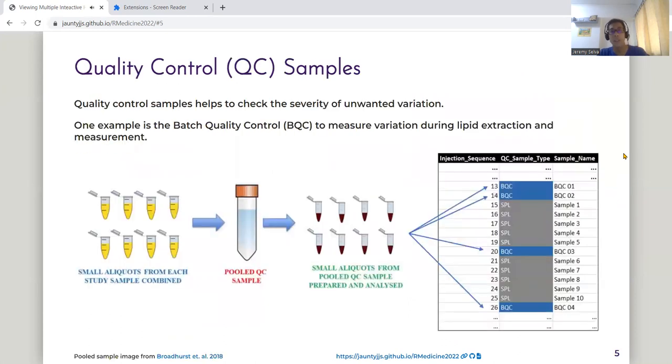To check for the severity of these unwanted variations, we have to use quality control samples. One example is the batch quality control, or BQC.